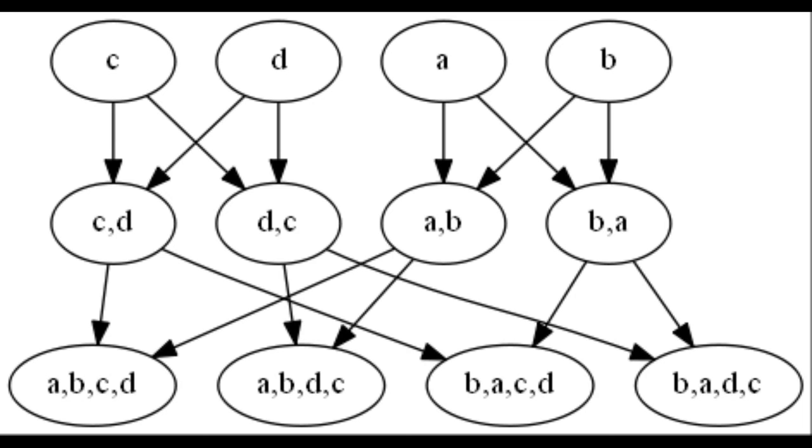This is the complete graph constructed based on the example sentence. The protocols are generated by starting at a leaf node and creating a protocol joining the node's two parent nodes. The graph is traversed backwards in this fashion, with each node that is passed getting a protocol that creates that node, until all of the original part nodes are reached. In addition to the set of protocols, the tool also generates a dot file that, with the help of a tool called GraphViz, can be made into a physical graph like this one.